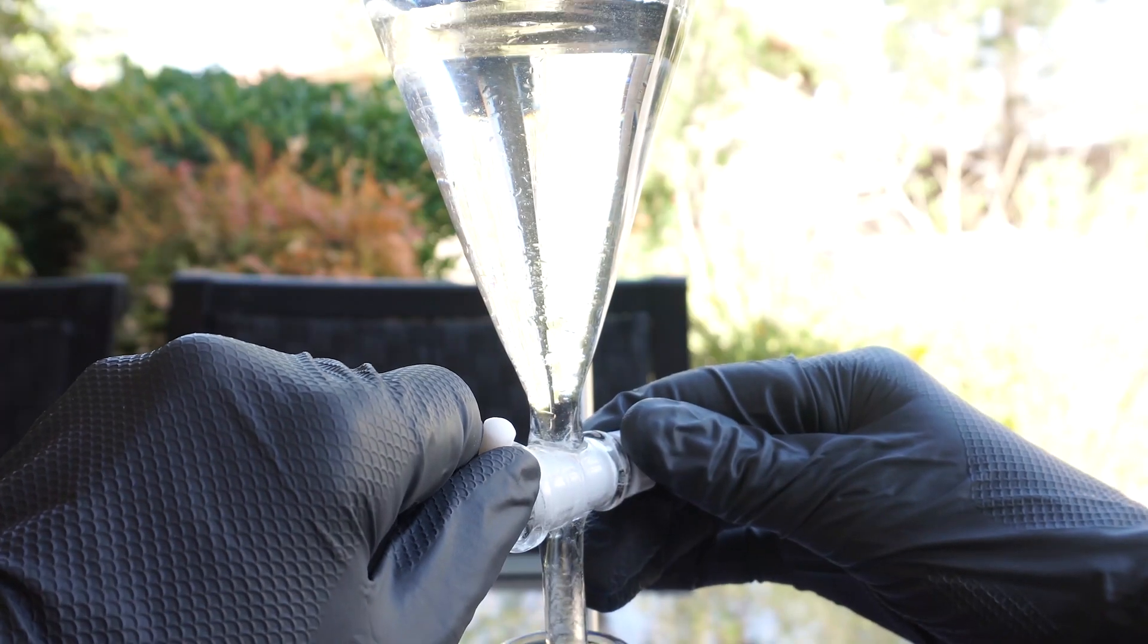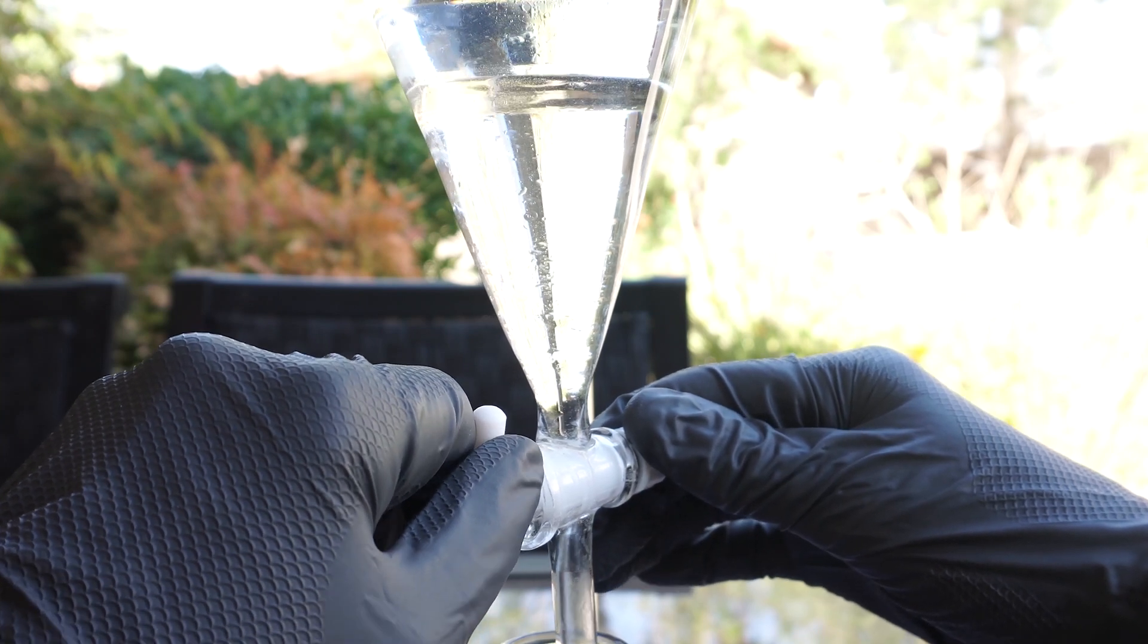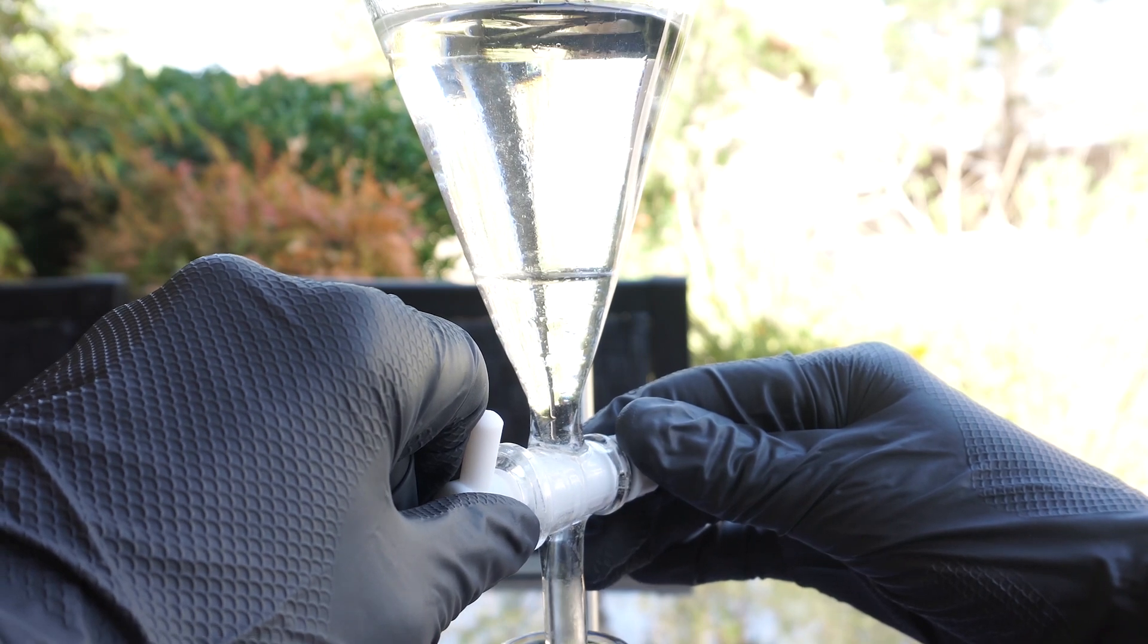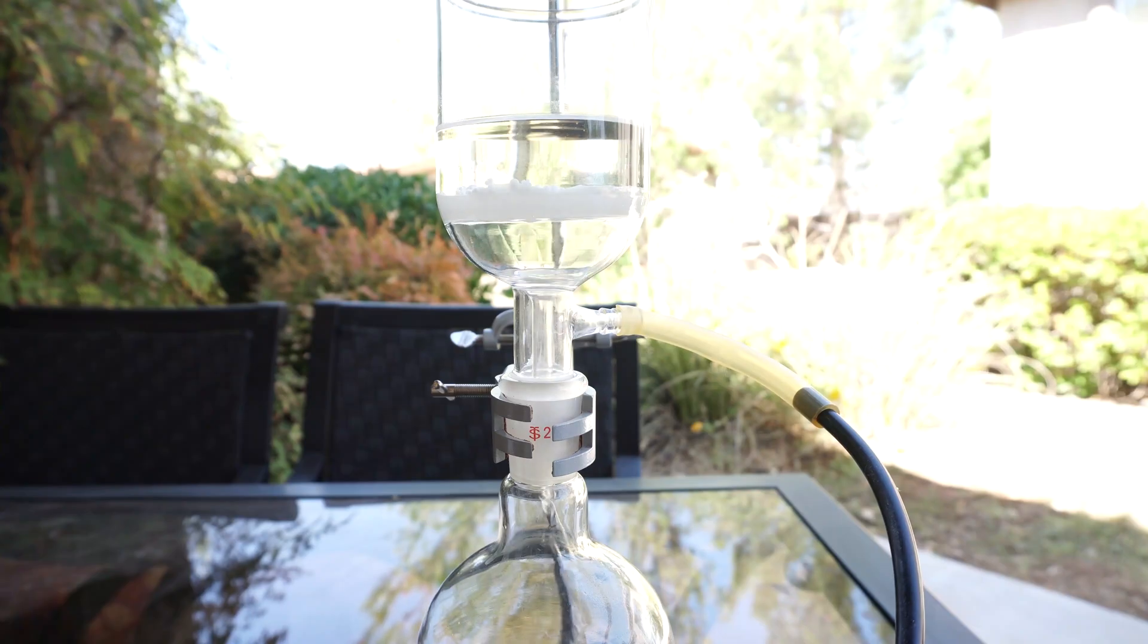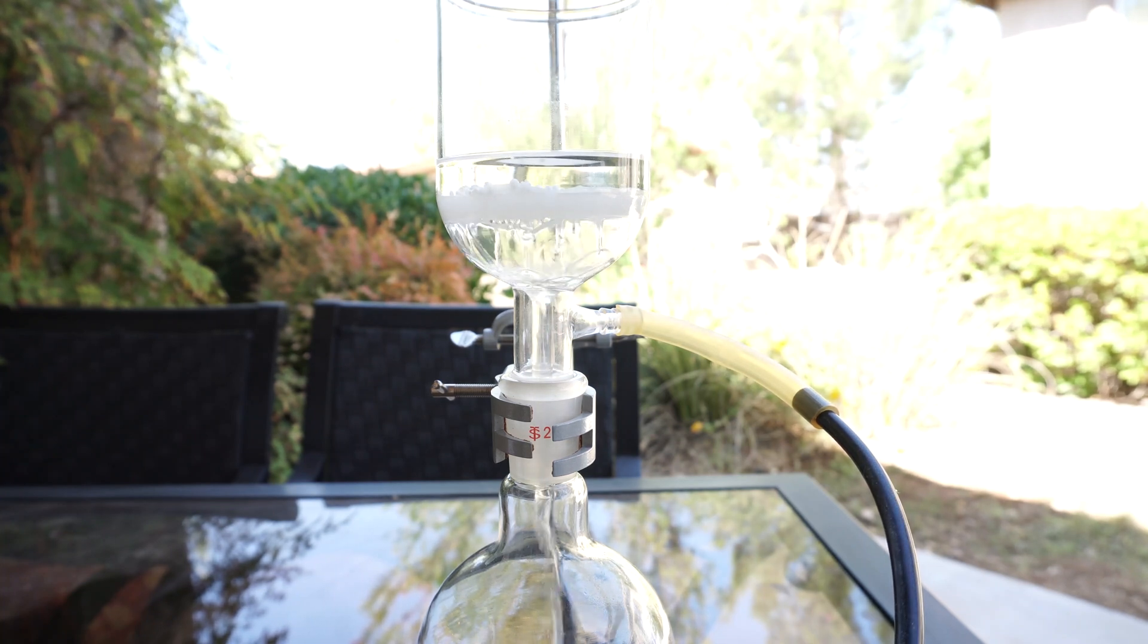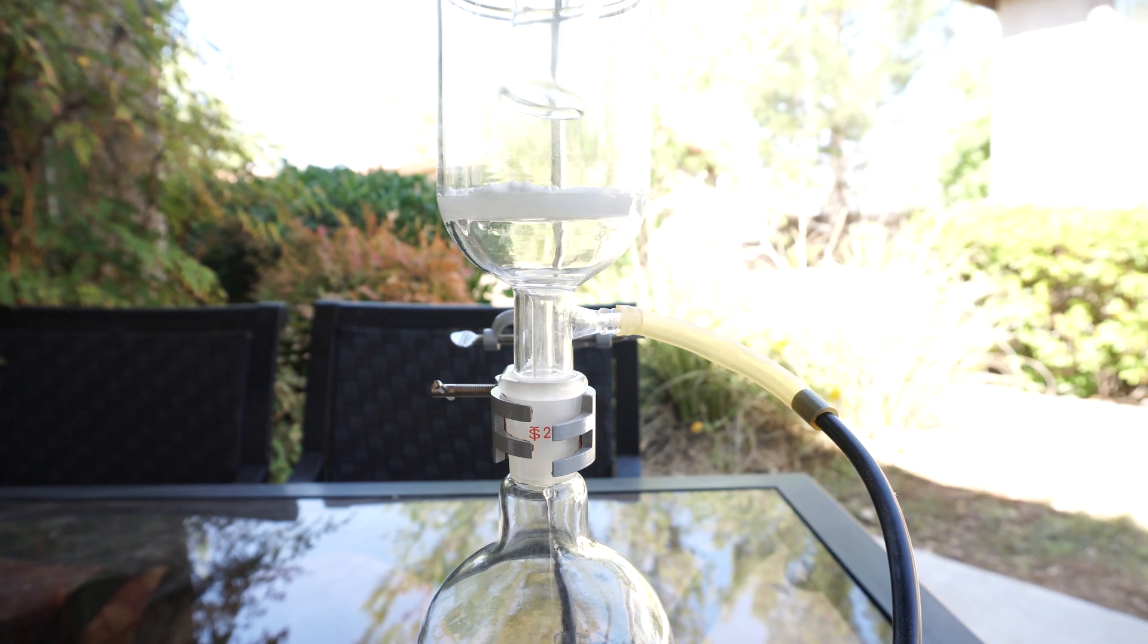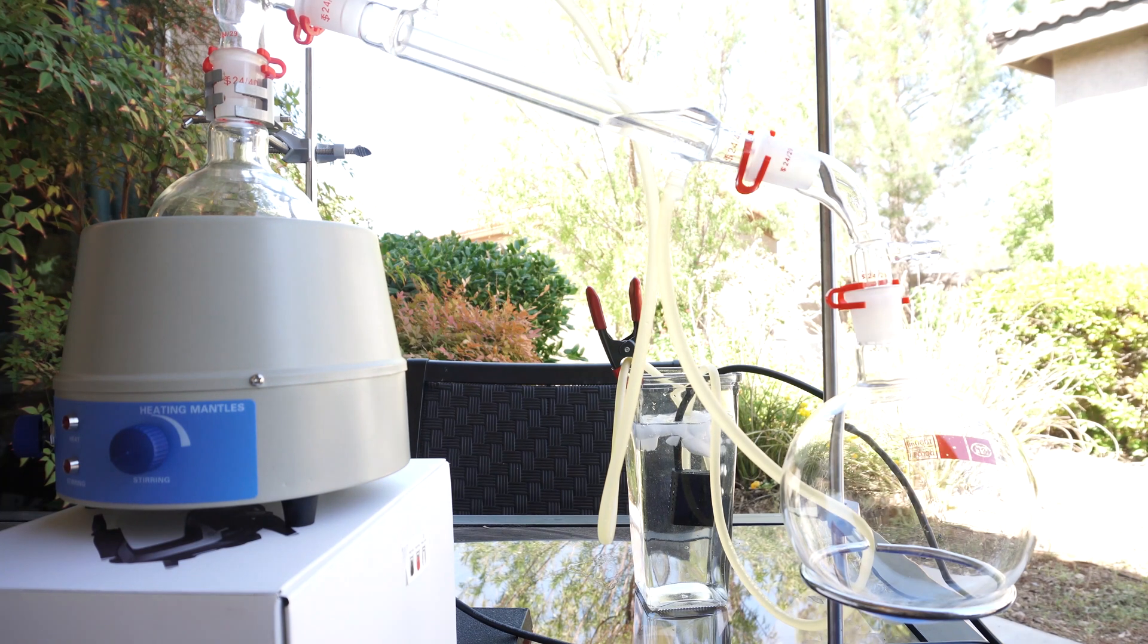Then I separated out the DCM into a flask containing calcium chloride to continue the drying. From here, I filtered out the calcium chloride from the DCM with a vacuum. I filtered it straight into a boiling flask because from here we'll boil off our DCM to recover it, which should leave us with pure cinnamaldehyde oil.